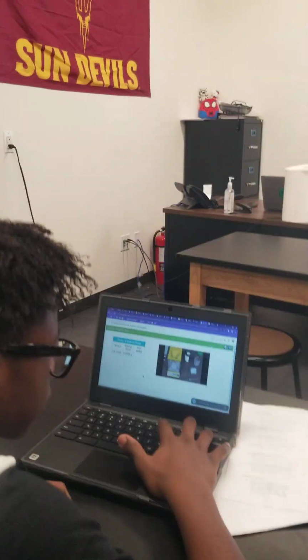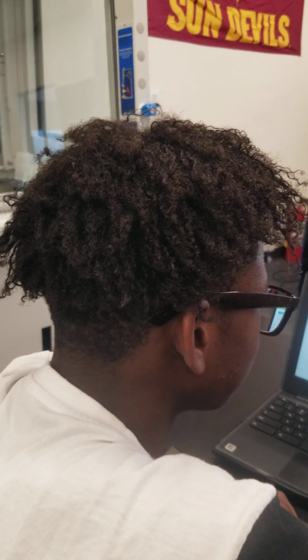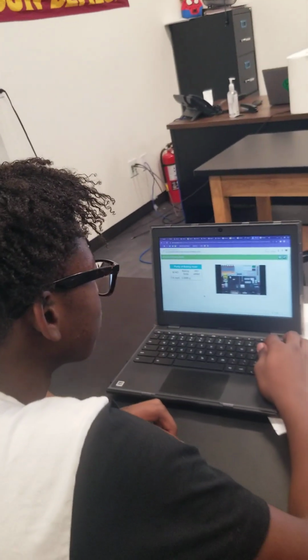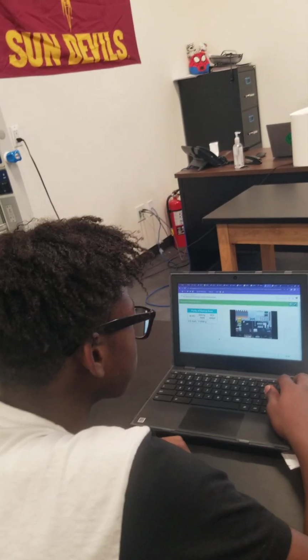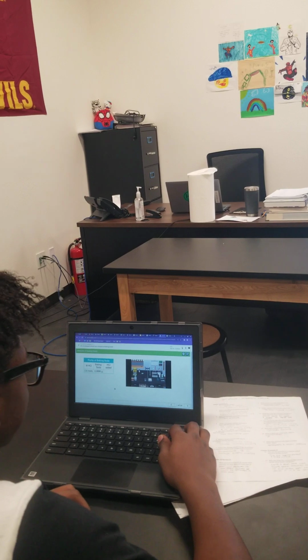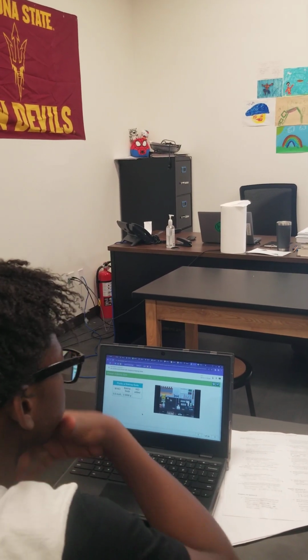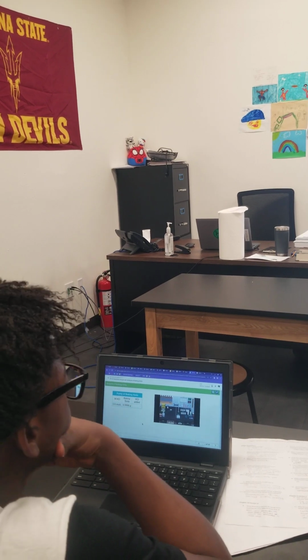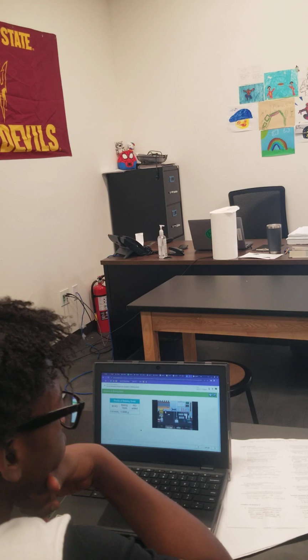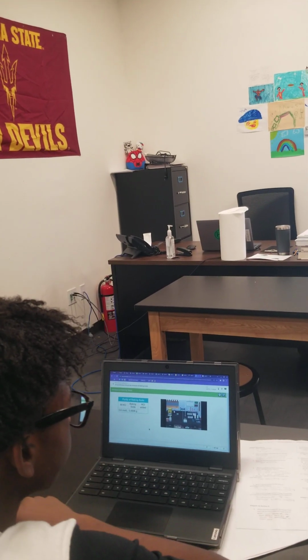So all you're doing right here in this lab, notice you're going to measure that out. So you're measuring this amount of baking soda, right? So what you're trying to do is neutralize this baking soda with HCl. It'd be a great lab to do in person, but it requires so much material. As you can see, I need a balance.